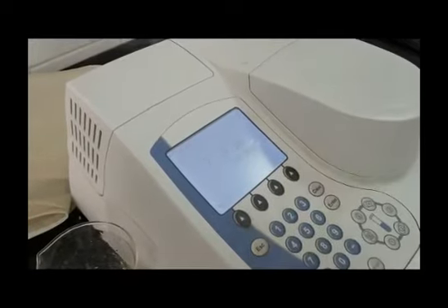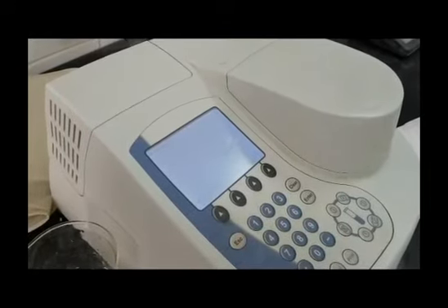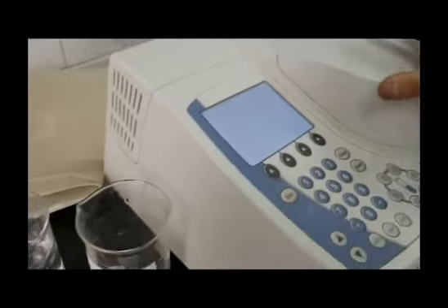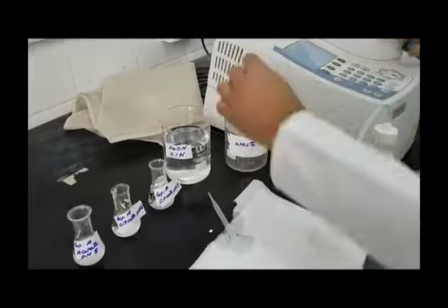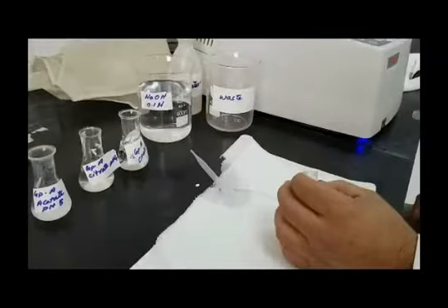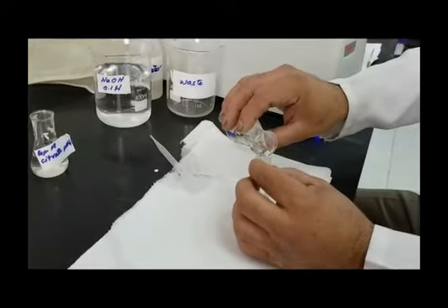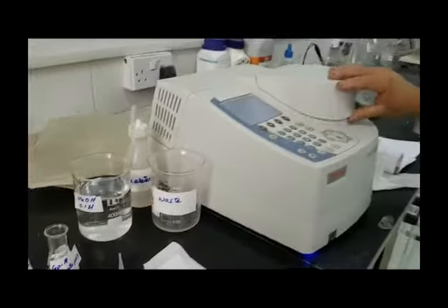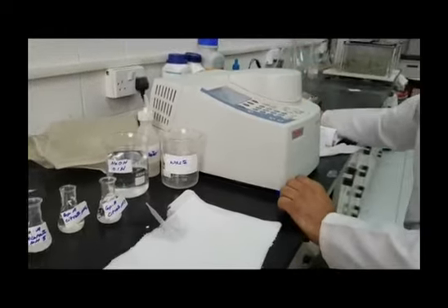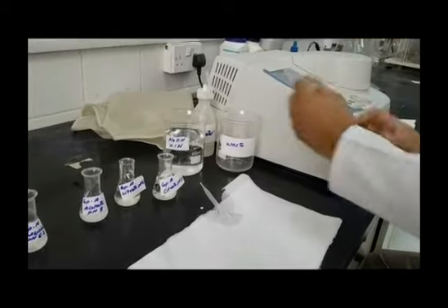Now, adjust the lambda by pressing the set nanometer button or go to the wavelength button. It depends on your used instrument. Then, after doing so, zero your UV spectrophotometer by pressing the measure blank button or zero button. Now you are ready to measure the absorbances of your samples.